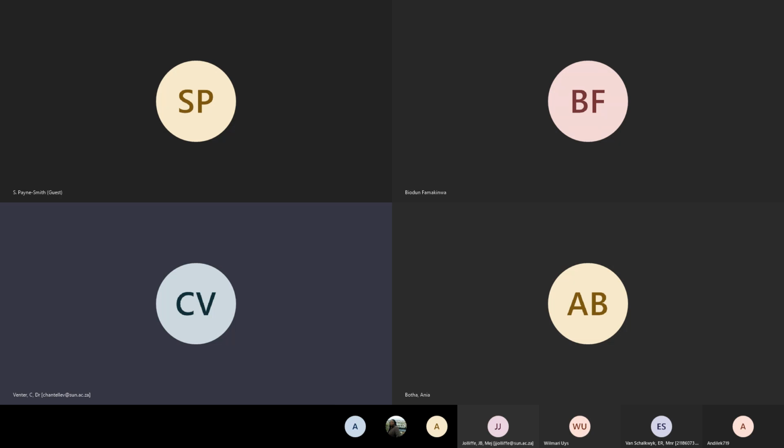And with today's software, the type of fluorescent images that you can get is very close to confocal images, not the high-end confocal, but quite good fluorescent images that look similar to confocal images, so you don't have to use a confocal for that.